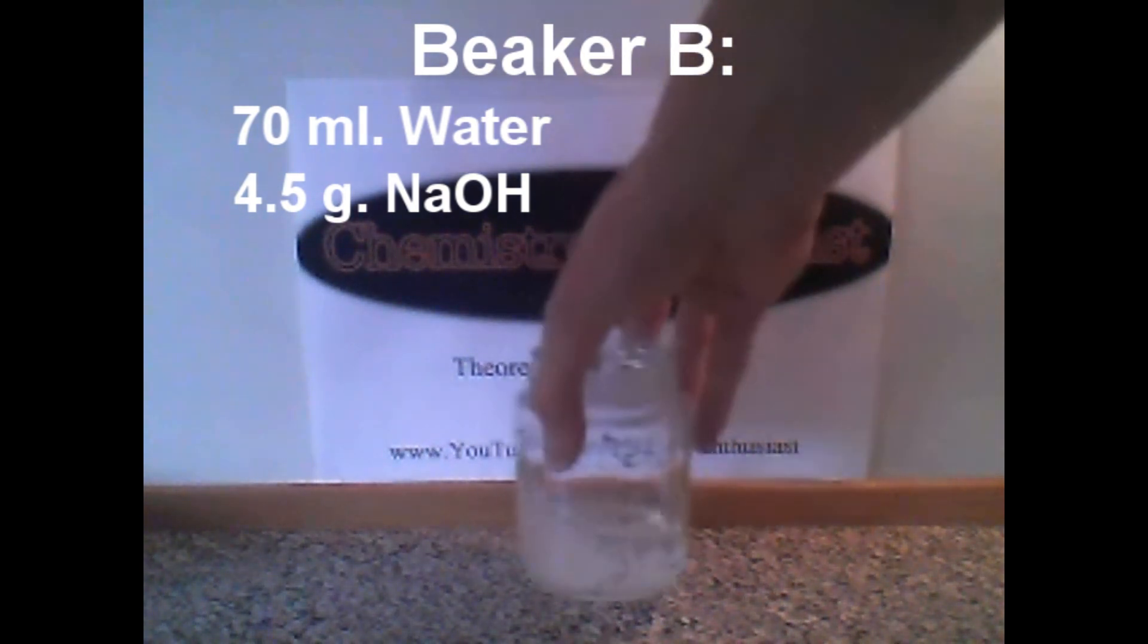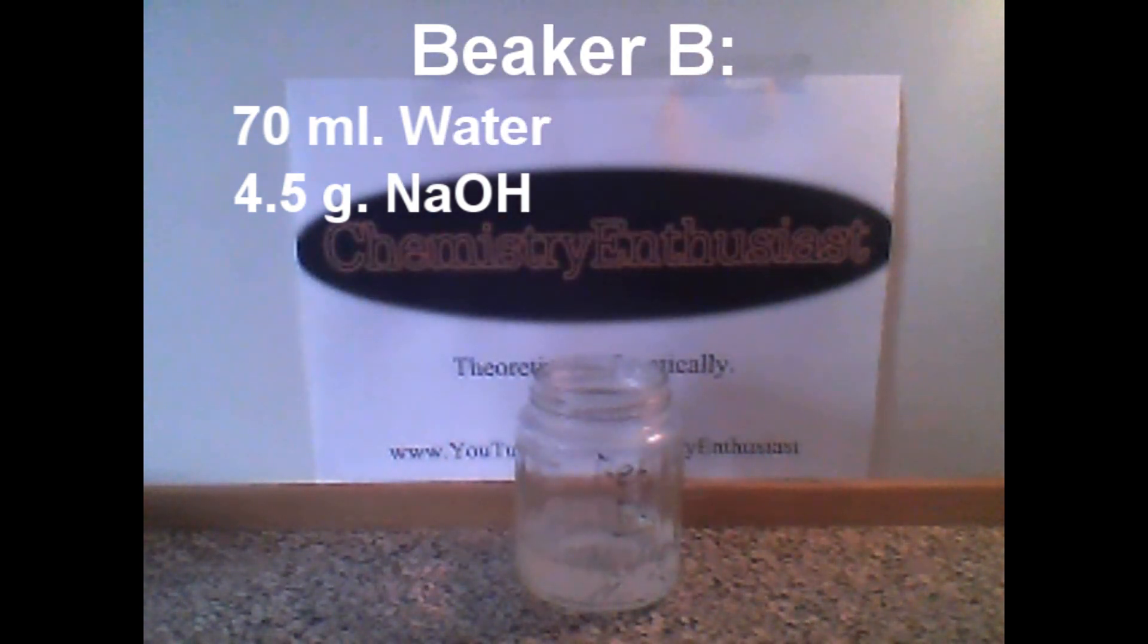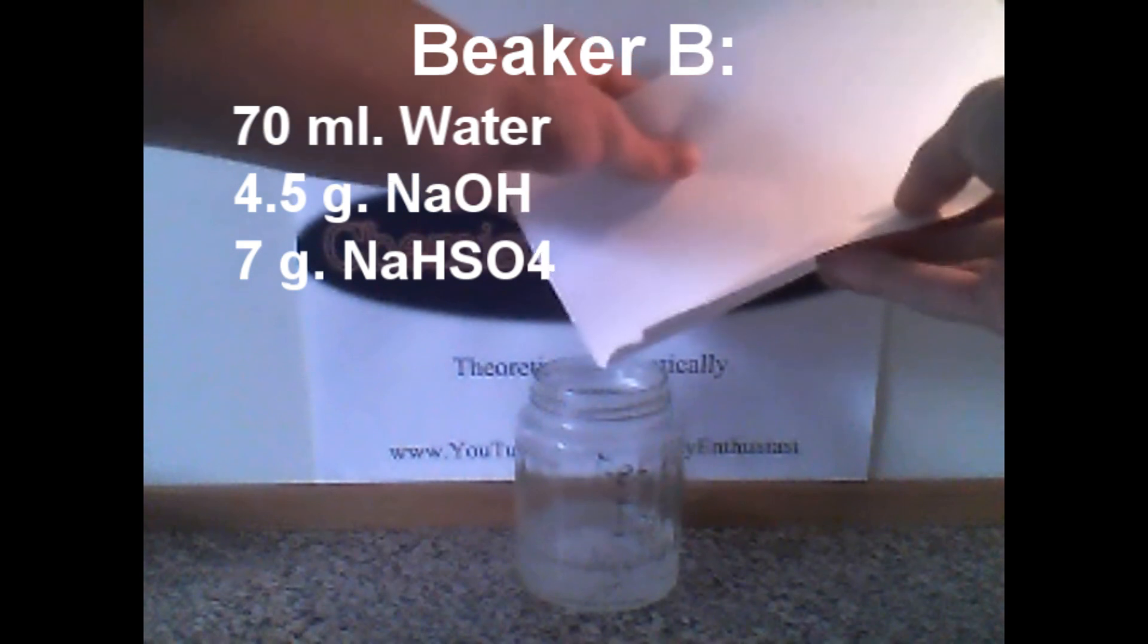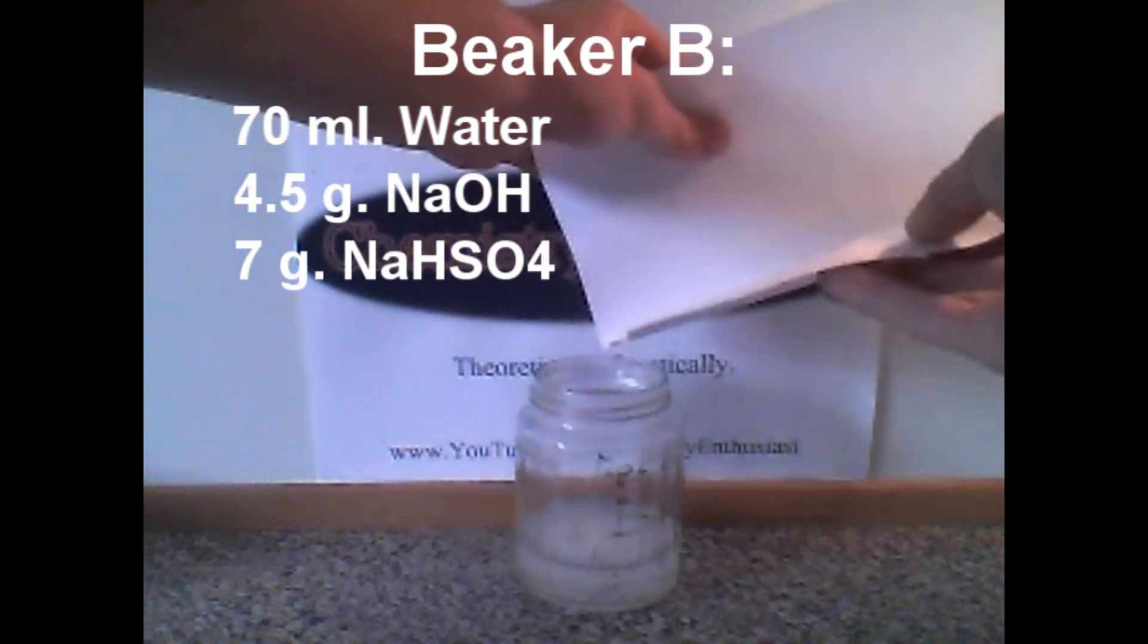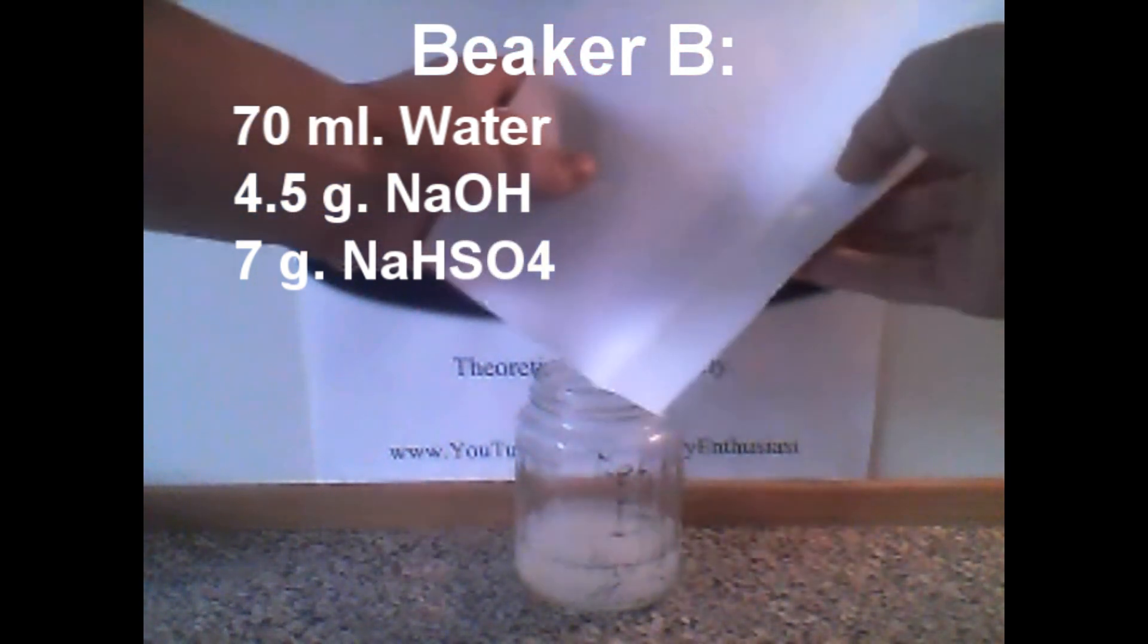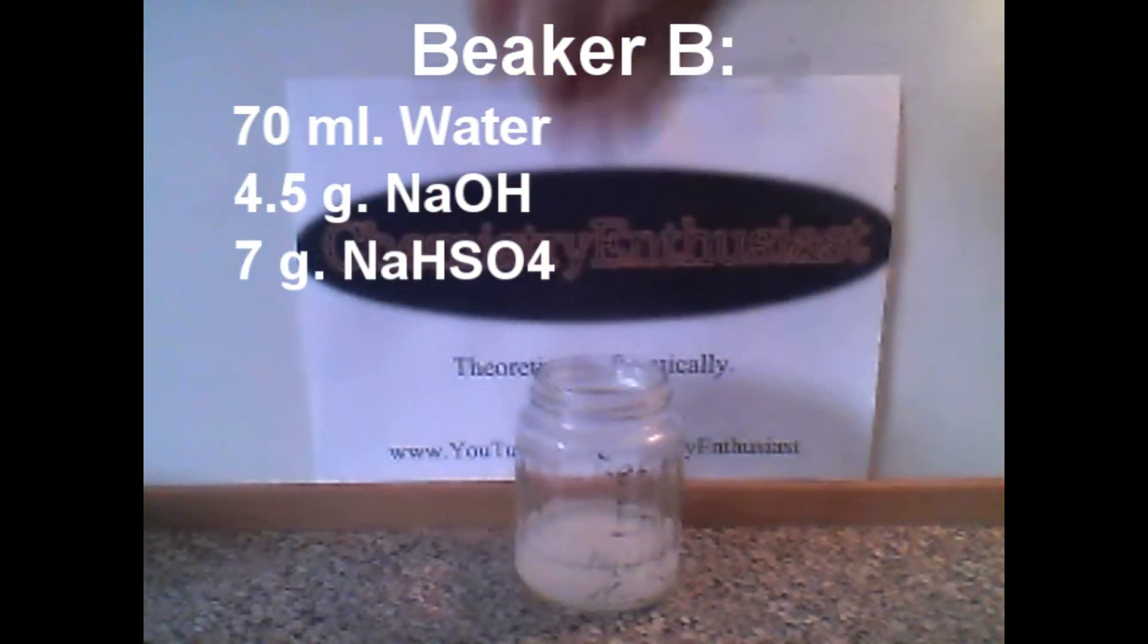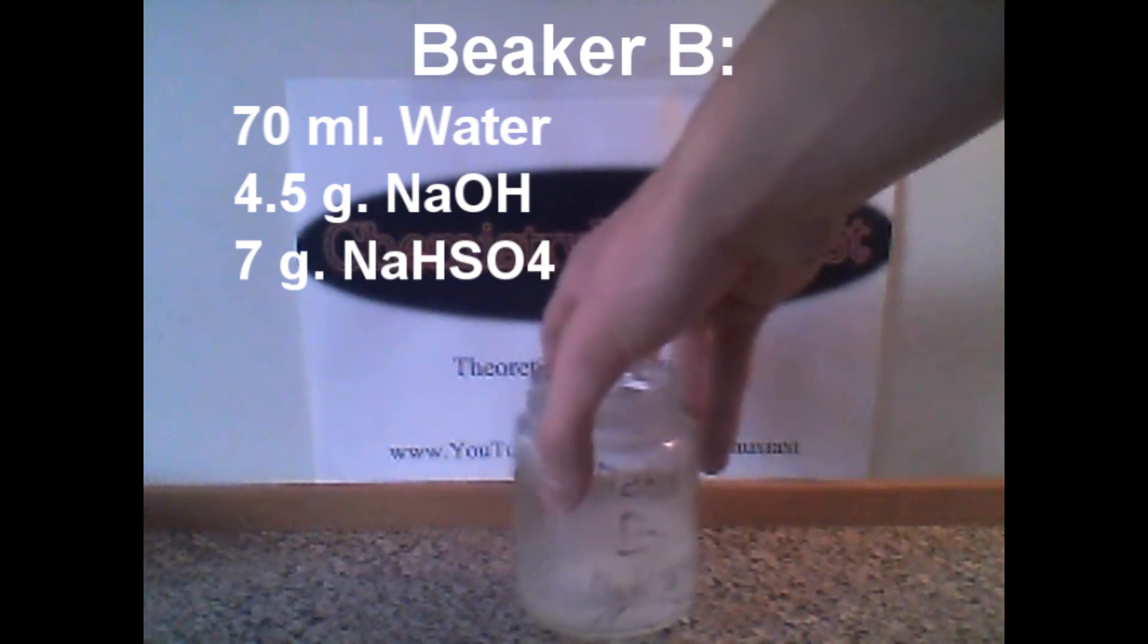Now after all the sodium hydroxide has dissolved, involving a lot of heat, then add 7 g of sodium hydrogen sulfate, which is also known as sodium bisulfate. These chemicals shouldn't be that difficult to dissolve in the water. As you can see, it is dissolving very quickly, almost instantly.